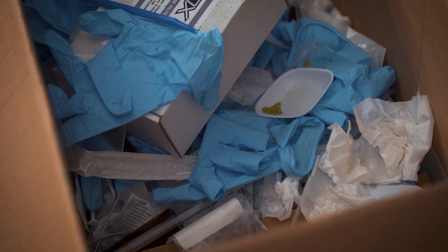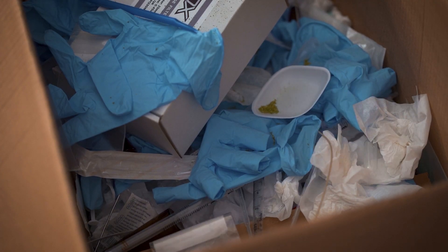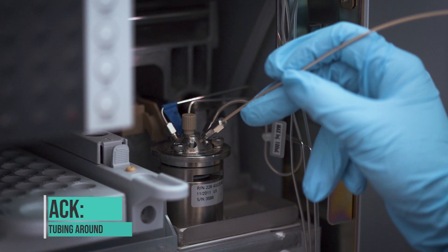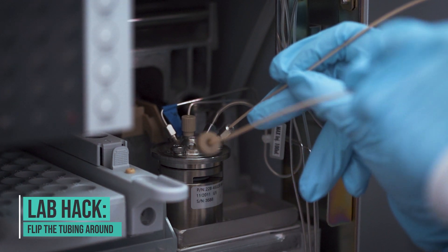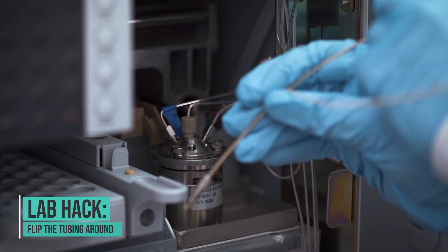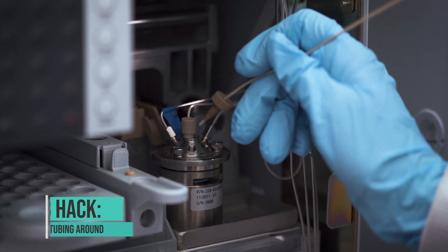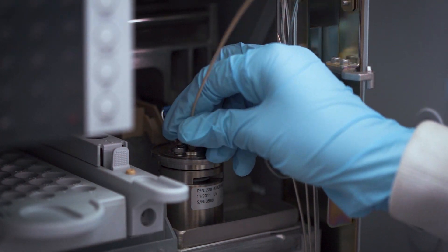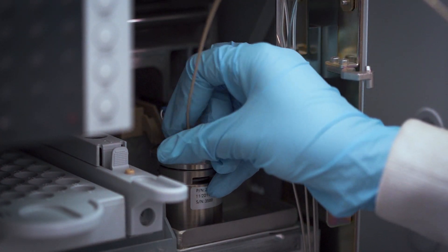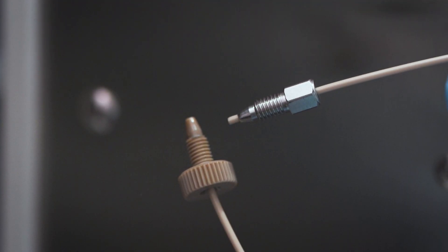If the pressure goes down, it's that line. Instead of getting a new line, a lab hack is you could simply turn around that line and plug the other end into the six port valve and blow the clog out the front.